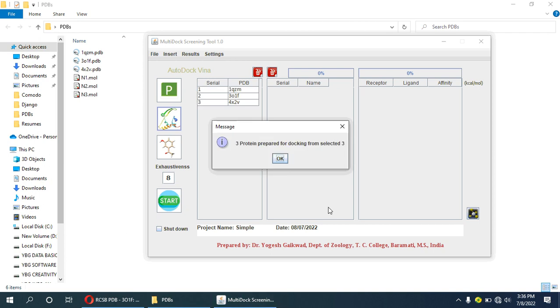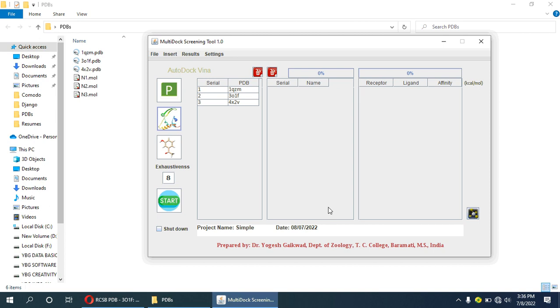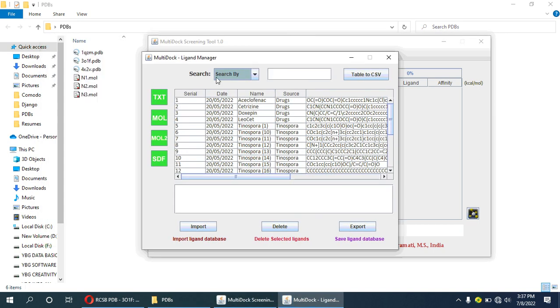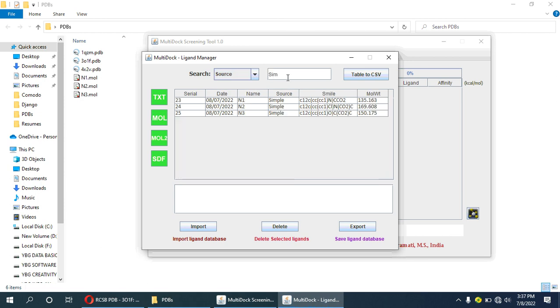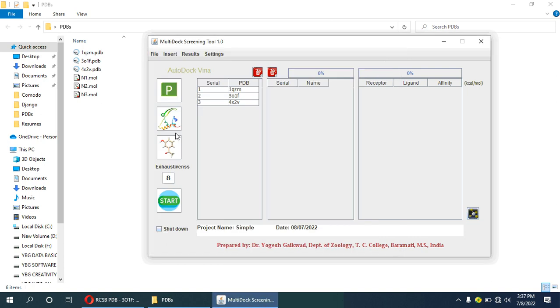All three proteins are added for docking. Now we will add ligands. I have added these three molecules — mol files or ligands — in the ligand database. We can add these molecules by clicking this small button, in whatever format we have, like mol2 format or SDF file. Now these three molecules — n1, n2, and n3 — are in the database.